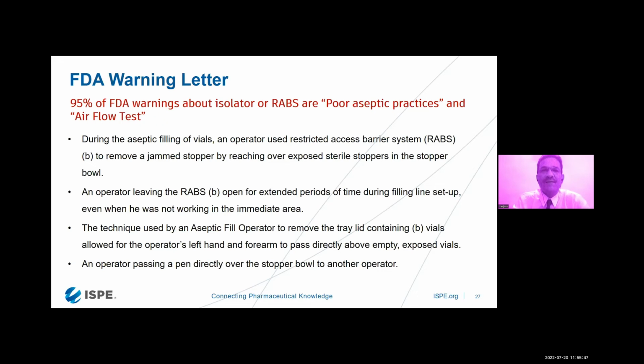Or basically I've seen cases wherein the lyophilizer operation, in most cases, is a manual operation where you put the vials, which are partially stoppered, into the tray. And then the operator under the laminar flow transfers them onto the shelf of the lyo. This is a very risky operation because the vials are exposed. When you lift the tray or stack the vials into the tray, invariably you are going to touch the vials.